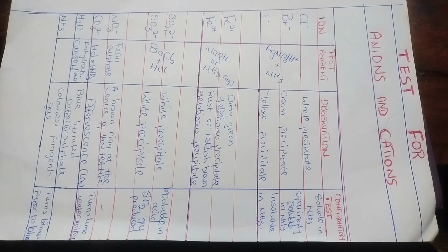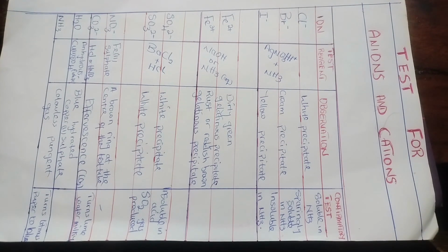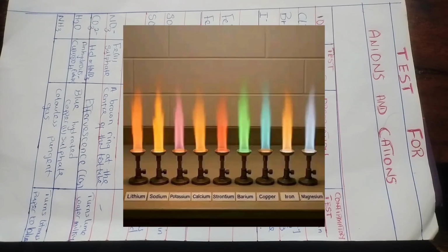Now, to test for cations and anions, the very first test we'll be looking at when testing for cations is the flame test. And this flame test is possible because certain metal ions give characteristic colors to the flame. For example, we have the sodium ion that produces a persistent golden yellow flame. We have calcium that gives a brick red or orange red flame.